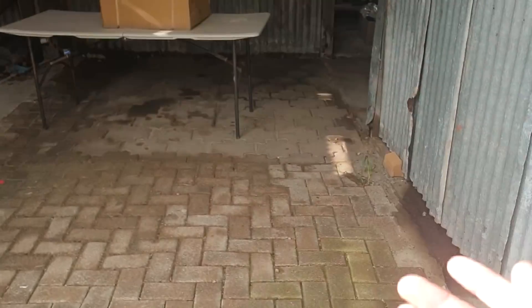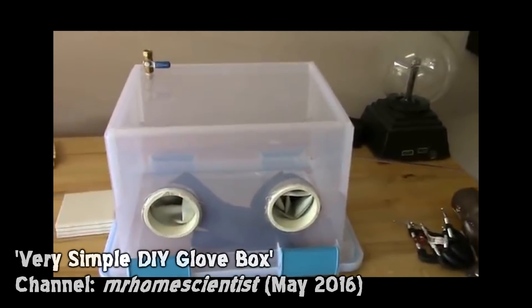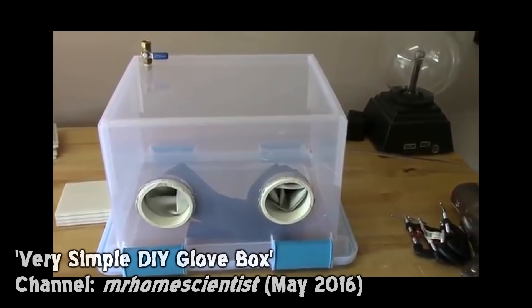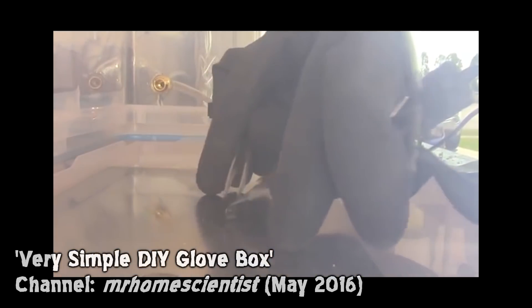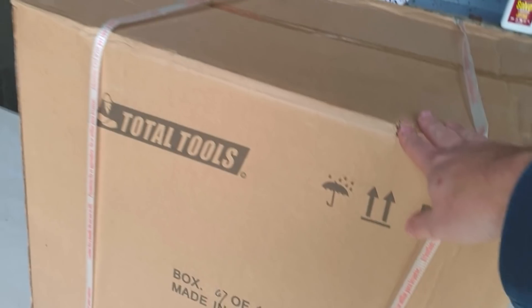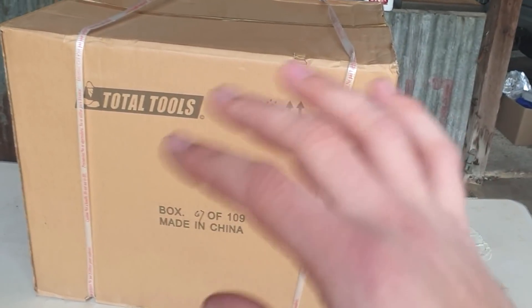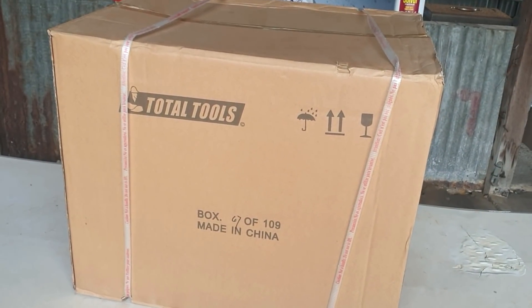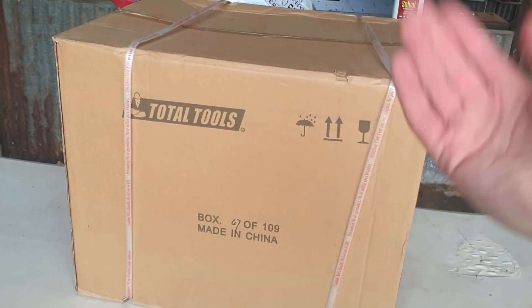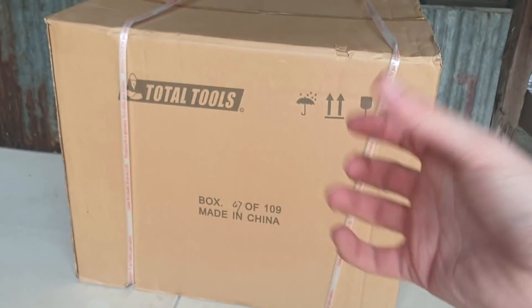I saw a video on making a homemade glove box by Mr. Home Scientist — years ago now — and I've been wanting to make my own ever since. Two things to consider: I generally suck at building things, so this project is going to use too much bloody tape. The other issue is I didn't really enjoy that his was all a plastic setup. While plastic is easy to build with initially, I think it limits you, especially if your substances are very prone to catching on fire.